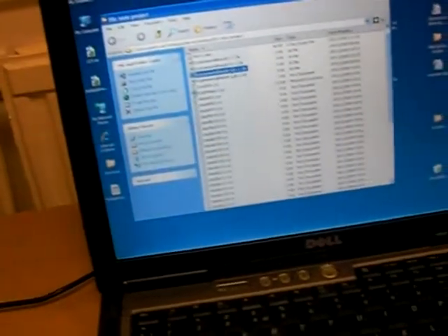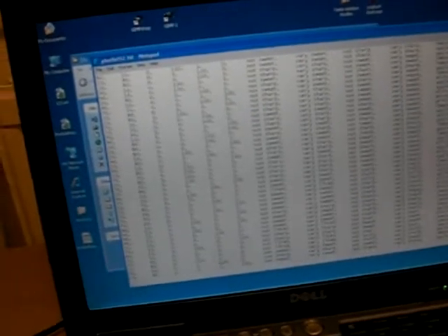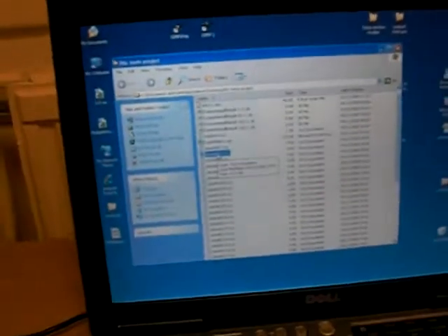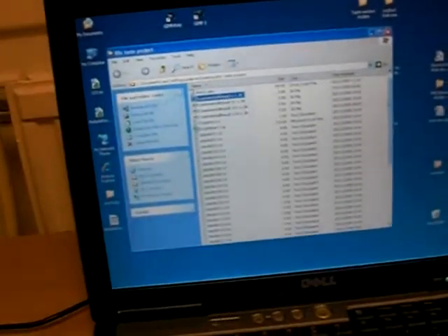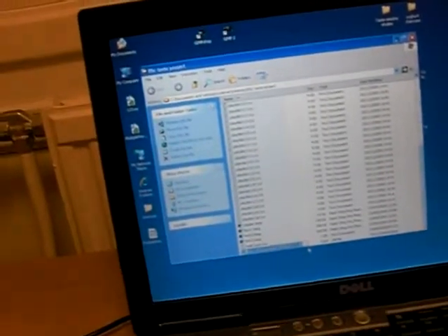Now, if you take these files and put them on your home computer and double click on them, you won't load up in Microsoft Excel. It'll probably load up in Notepad. Hopefully it will actually ask you what program the computer should load those files within. So let me just simulate this quickly. I've simply copied the very first lot of results. Instead of calling it a .ja file, I'm going to call it a .aj file.